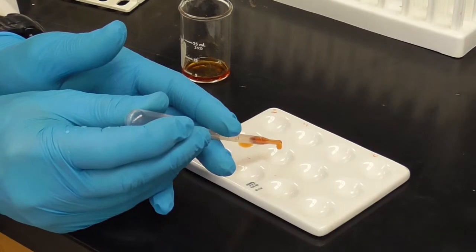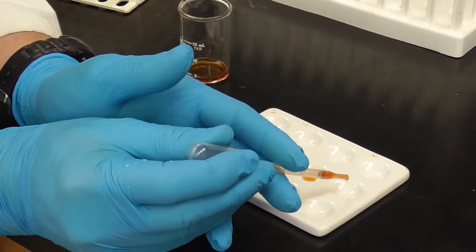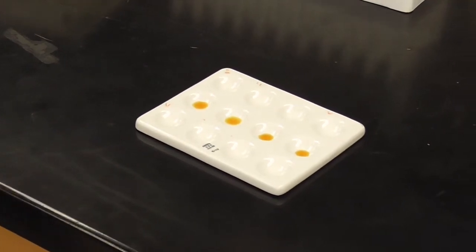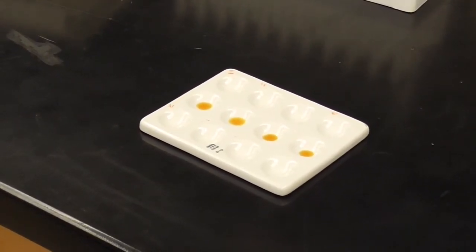1, 2, 3, 4. All right, that doesn't take very long, right? All right, so we're ready. We just wait for 15 minutes back over here on our 37-degree water bath. And so we'll cut the video here and we'll come back in 15 minutes.